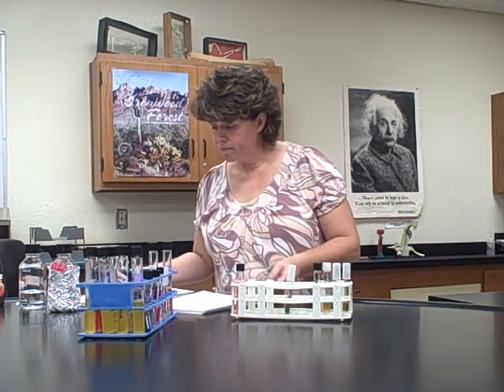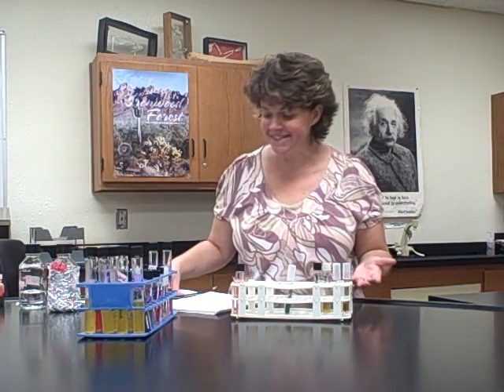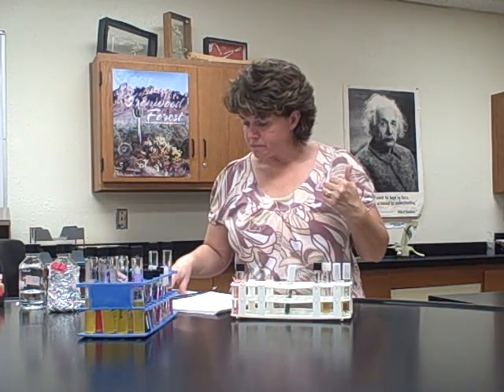In the data table, it has the 4 bacteria on the left, and then it has 24 hours and 48 hours. Well, obviously we're not looking at them at 24 hours because it's already been almost 48. So you'll just draw a line through the 24-hour. If we met every day, that's something we could do, but unless you wanted to come in on Thursday to look at them, we won't be able to do 24. I am taking them out of the incubator at 48 hours, so even though you're looking at them a week later, okay?